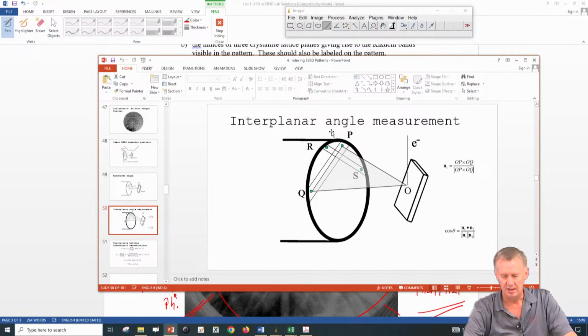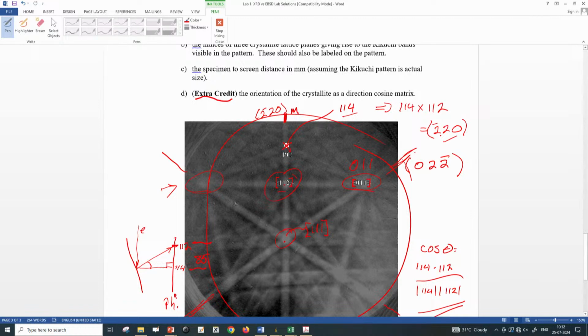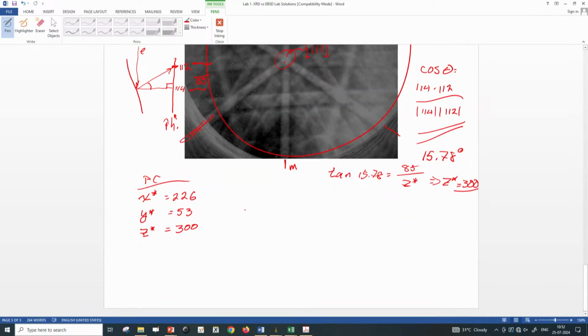So it's going to be a 0 component in Z from the phosphor screen coordinate frame, a 0 component in Y, and 1 in X. Right, so we don't even have to do this cross product. See how I'm cheating on that one? Right? So let's cheat on that one. So this 220, bar 220, in the phosphor coordinate frame has a normal, which we're going to call N1, and it's going to be 1, 0, 0. I can put commas there because it's just a vector. Right?